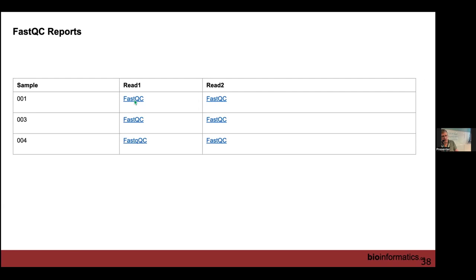And it results in some issues in per tile quality. You see that there as well. If we look at the quality scores here, we've got a shift where everything is high quality to a lot of noise in here as well. We're seeing that all along. The messy profiles in here indicate something's going on.